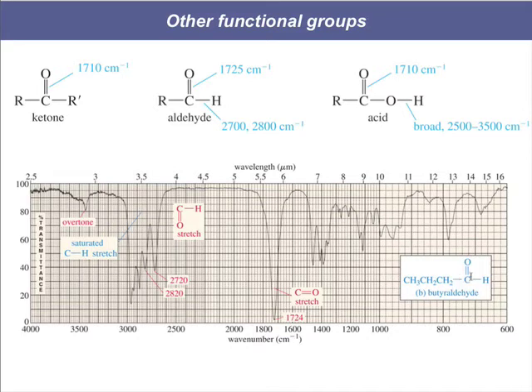We see our aldehyde CH stretch at 2700 and 2800. These additional peaks right here showing up just below our normal alkane stretch, our baseline. That's our aldehyde CH stretch. And we have again seen an overtone, a 3400 overtone that's a multiple of the 1700 carbonyl stretch.